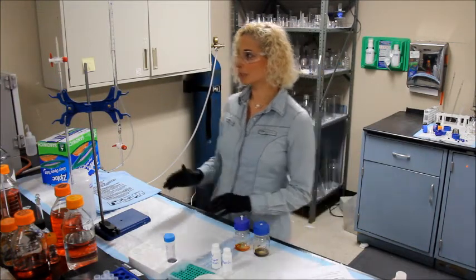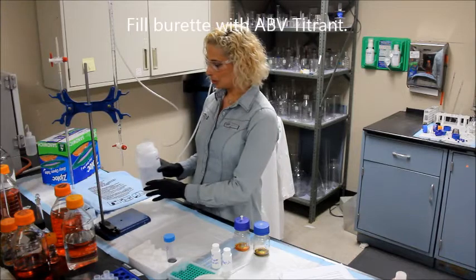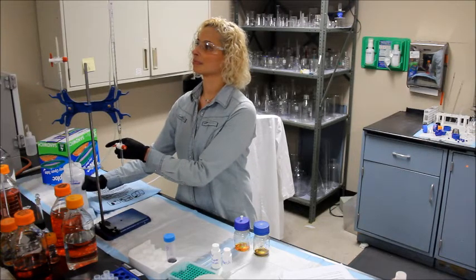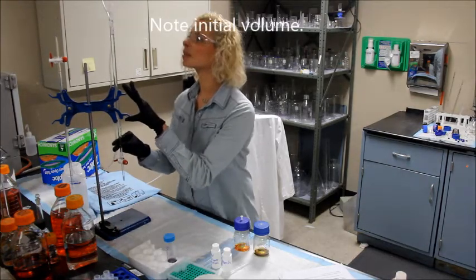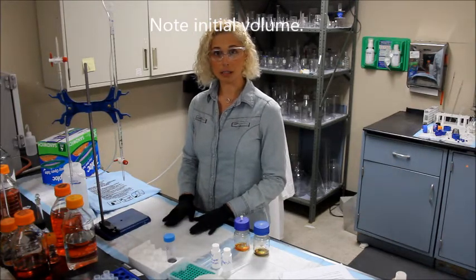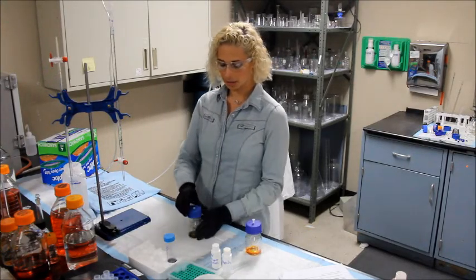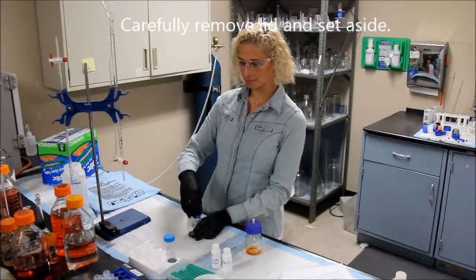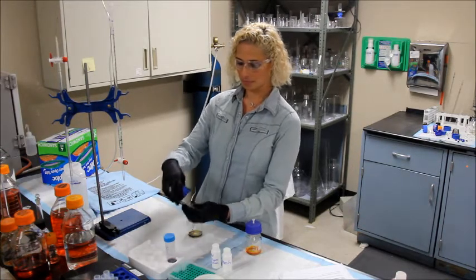You will now fill your burette with the titrant provided — I am using our new auto burette refillers. Note your initial volume, which mine is at zero. Now you're going to start your first titration of your sample. Very carefully, remove the lid of the first reaction bottle and set aside.